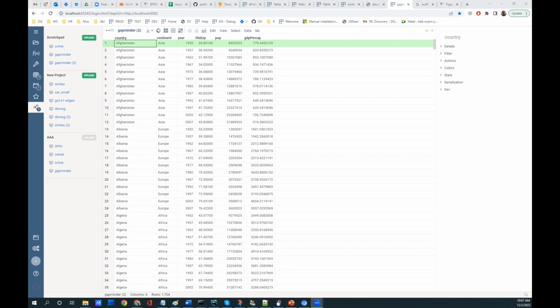There is definitely room for improvement, and we have a lot of thoughts on that, and we actually have an internal project to improve all of these processes. Because I'm used to, say, opening Google Docs or Google Spreadsheet, where the changes are saved as you make them. Essentially, you don't have to worry about clicking anything.